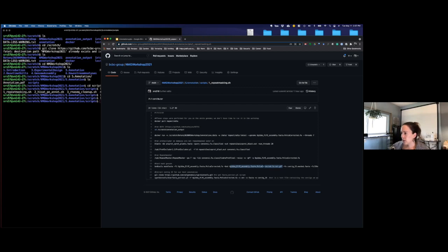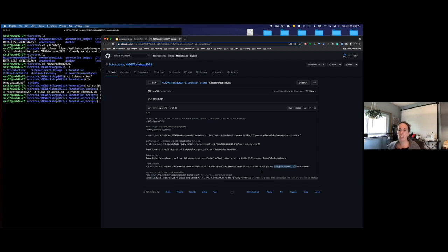So it'll just take the GFF and then the original assembly file, and then it'll generate, oh, I know why we did it this way. I must have taken it out beforehand. Yeah. So we're actually just masking one of the contigs. Of course, if you were doing your real project, you wouldn't do it this way. You would run this on the whole genome. But for a test data set, we're actually just going to look at this contig 15, just one contig out of the whole thing. As you can guess, our final results aren't going to be great, but it allows us to at least try some of these commands out.